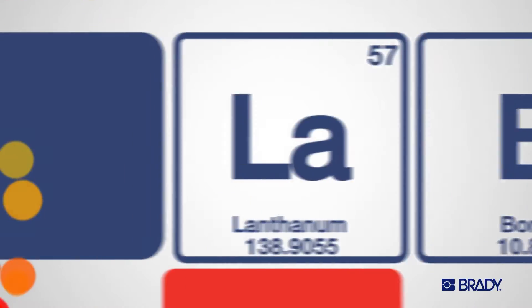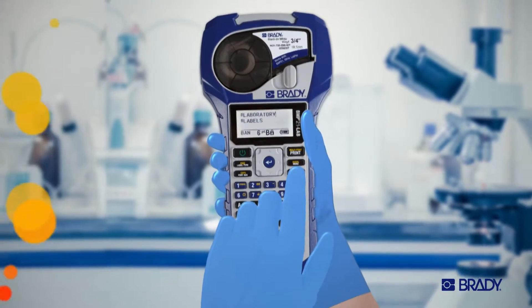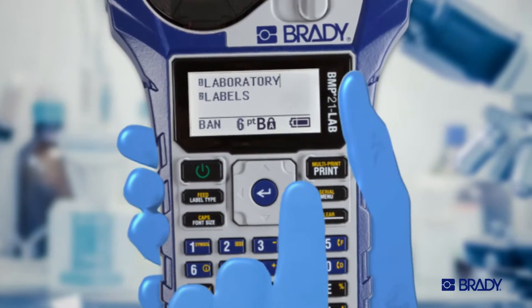Meet the BMP21 Lab Label Printer. It's powerful, affordable, and can work wonders saving you time and ensuring your data is accurate.